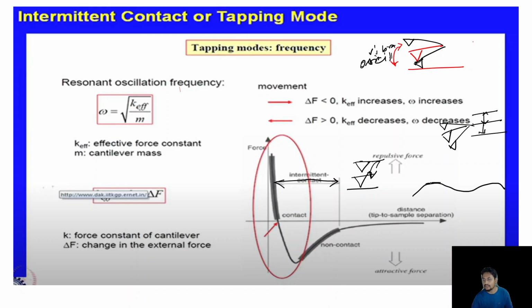So whenever it is in this position, the tip should go up to this position, but as the surface is there, it cannot go. Let's say it is going only up to this. So this is, let's say, delta x1, and this is delta x2, because it cannot go further, and delta x2 is lesser than delta x1. And in case of this, the tip is going the total.